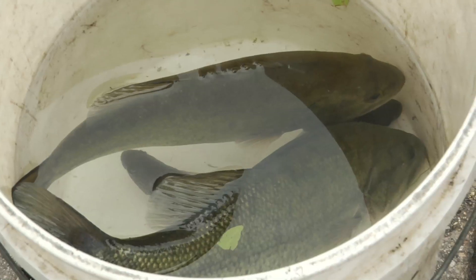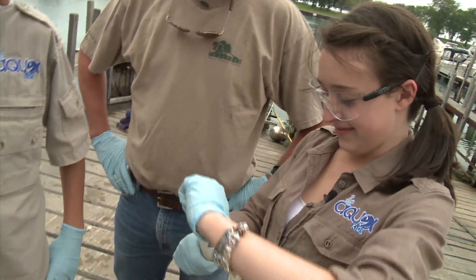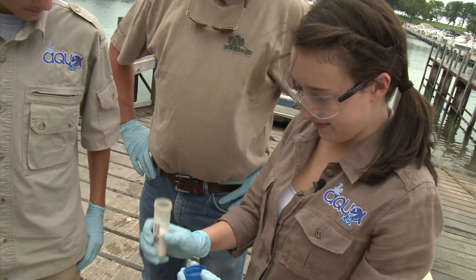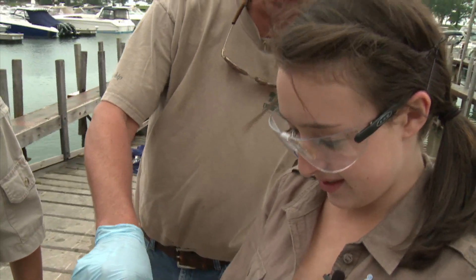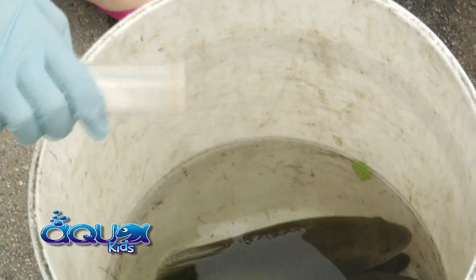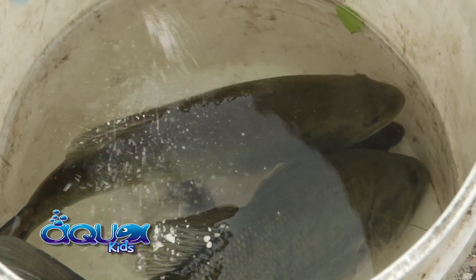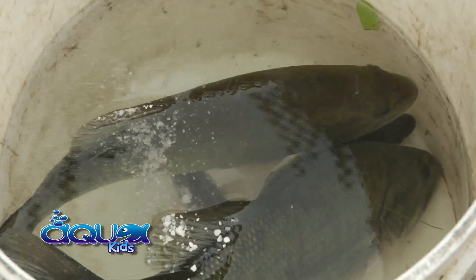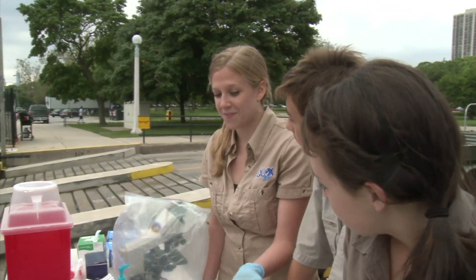Now it's time to euthanize a few fish that we have to do necropsies on. Katie's got that job — you're just going to pour a little bit of that MS-222 in the water. About five milliliters worth — you can eyeball it, just pour it in there. A little bit more. That'd be good enough. All right, Paul, looks like we're ready for the necropsy.